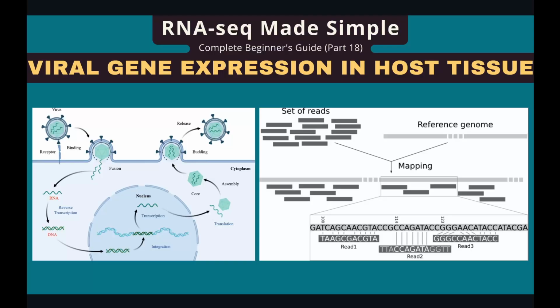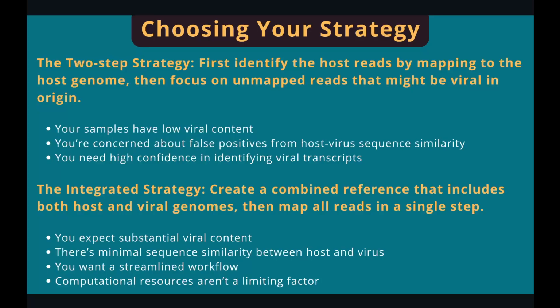In this video, I'm going to show you how to quantify viral gene expression in host tissues. There are two ways to tackle this problem. The first one is the two-step strategy. In this strategy, we map the reads to the genomes twice.